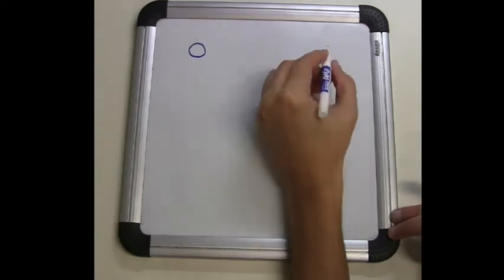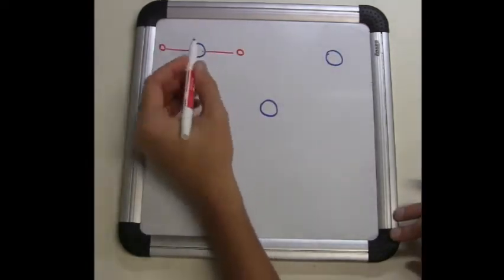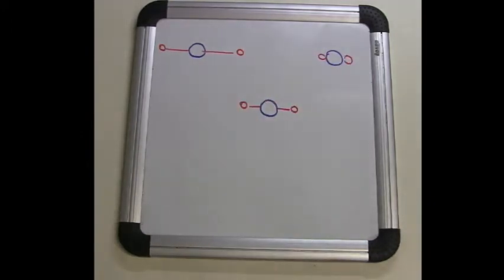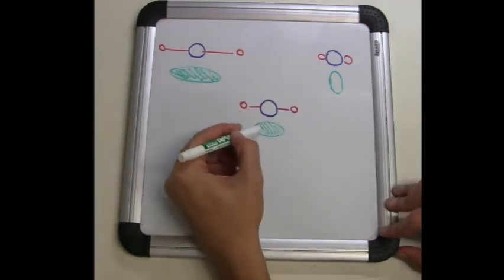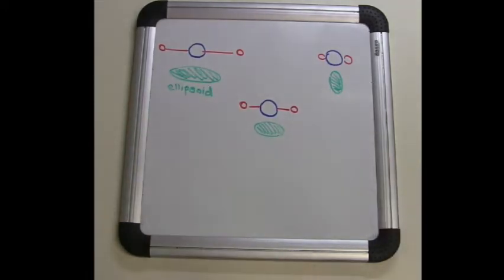TERS is based on Raman spectroscopy, which is highly sensitive to molecular vibrations and depends upon the change in the molecule's polarizability. For instance, the simple symmetric stretching mode of the carbon dioxide molecule affects the shape of its polarizability ellipsoid, which then manifests as a unique signature in its Raman spectrum.